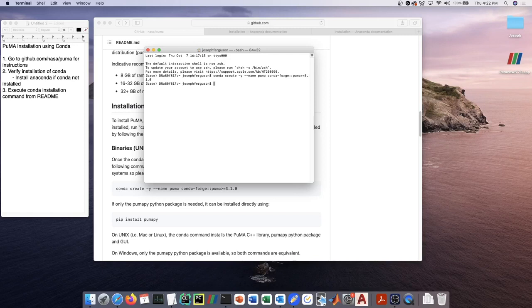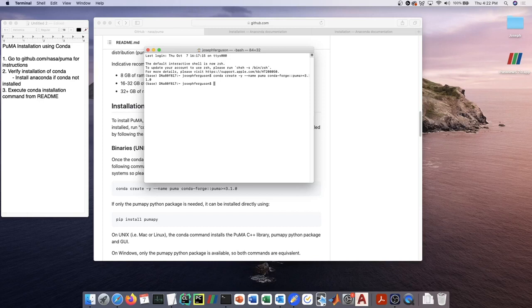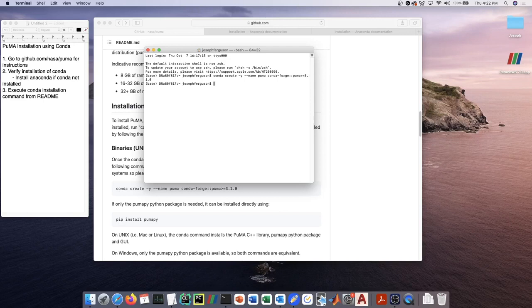Okay, so the installation looks like it's finished. At this point, all you have to do in order to launch the PUMA GUI—and I'll in other tutorials go through the actual functionality of PUMA—but since we use conda as a way of managing the environments, we've created a new environment called PUMA.